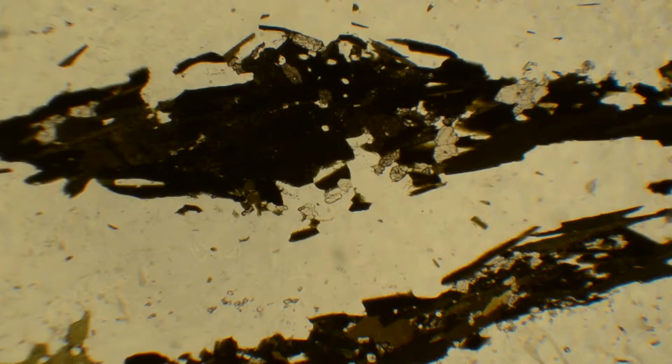Let's talk about color. Whenever I talk about color, I am specifically referring to the observed color, or lack of color, under plane polarized light only. Notice that some minerals, like this brown one in the center of my view, change color when I rotate the stage. This property is known as pleochroism and is specific to certain minerals.